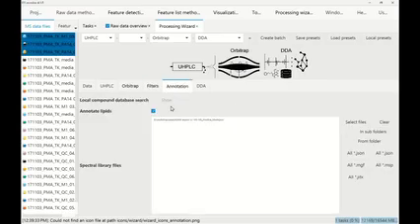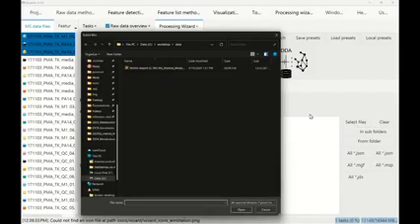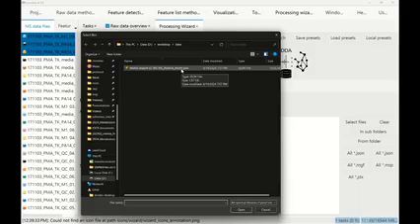The only thing that we're still going to set here is the spectral library files. In case you have some spectral library files on your laptop, there was also one that we supplied from MassBank of North America, because it's quite a medium-sized spectral library. You can just click on Select Files, and in the data folder you should see one .json file.